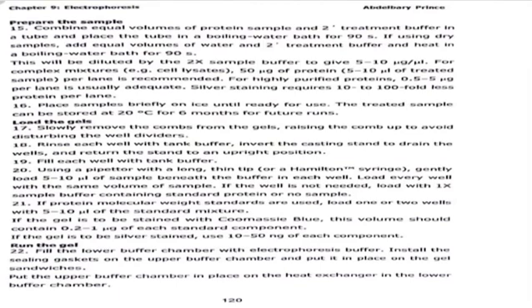21. If protein molecular weight standards are used, load 1 or 2 wells with 5 to 10 microliter of the standard mixture. If the gel is to be stained with Coomassie blue, the volume should contain 0.2 to 1 microgram of each standard component. If the gel is to be silver stained, use 10 to 50 ng of each component.